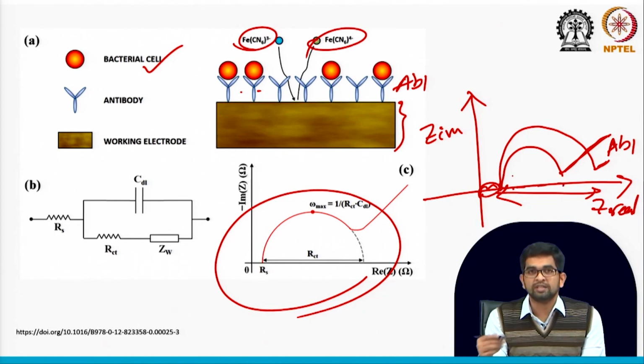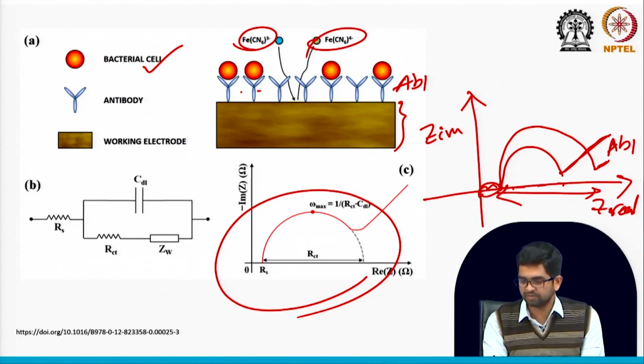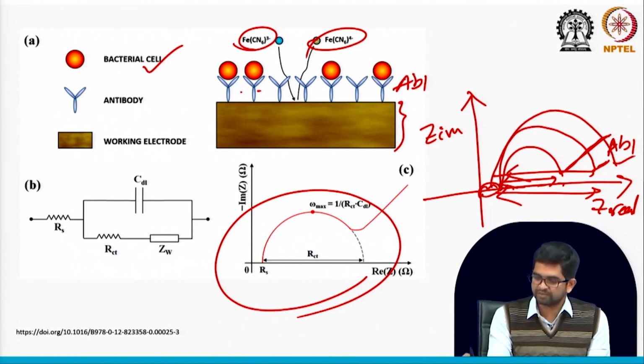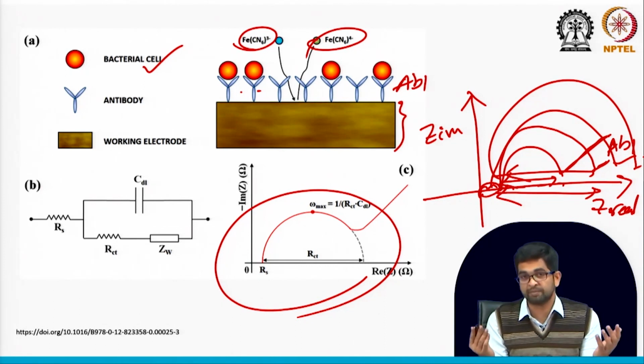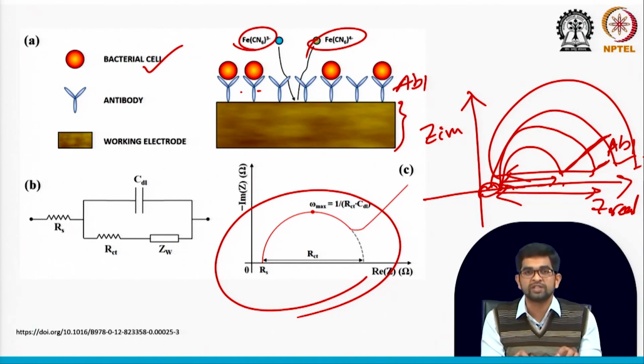When we increase the biological molecules on the surface, see, the first RCT value is this one, the second RCT value is this one. Clear? Now if we increase the target concentration, slowly this value will change this way, and we will see the change. Clear? So this is a pretty easy method; definitely from this curve we can predict that some molecules are immobilizing on the surface, and we are getting more and more target molecules on the surface.